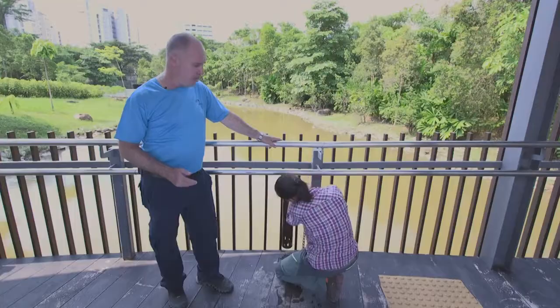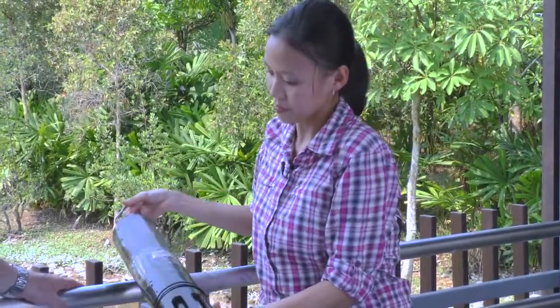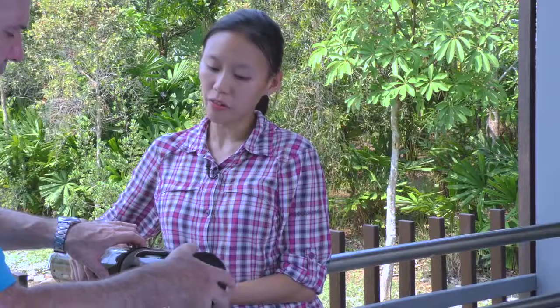An alternative to the manual grab sampling that we've just observed is continuous monitoring with automated instrumentation, such as the YSI 6600, as we see here, that is located at the outlet of the Jurong Eco Garden. Grace, could you demonstrate for us, please? Sure, Prof.